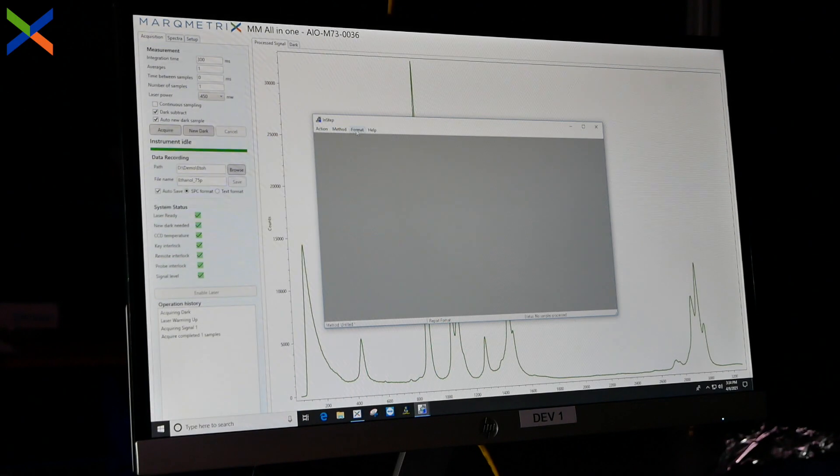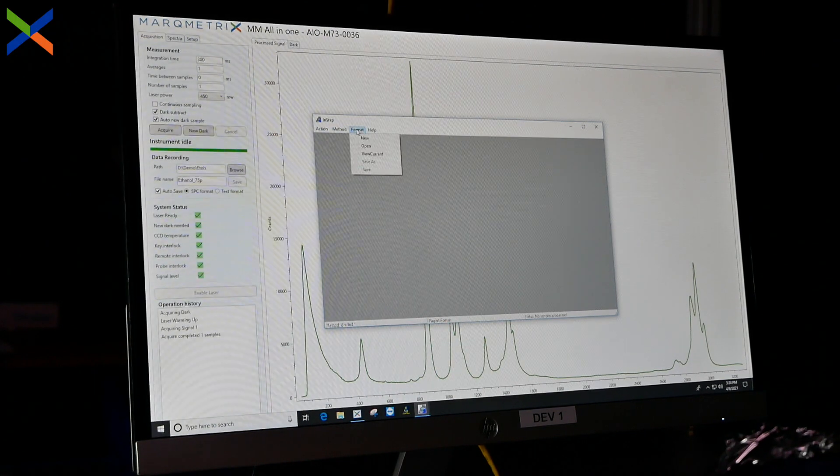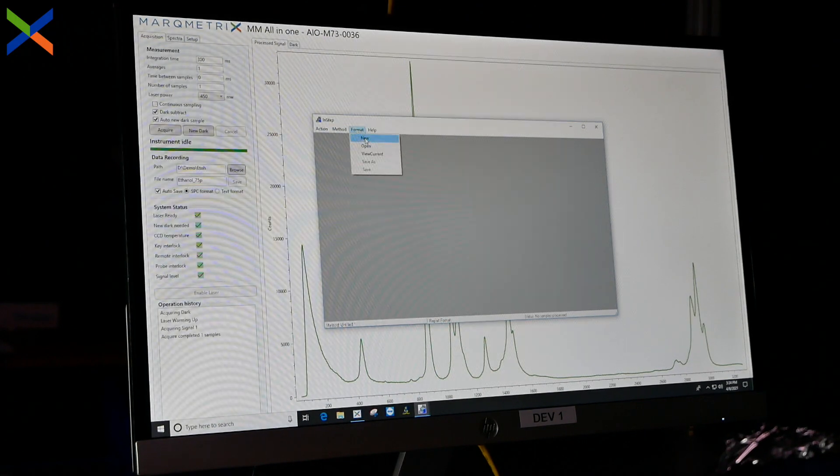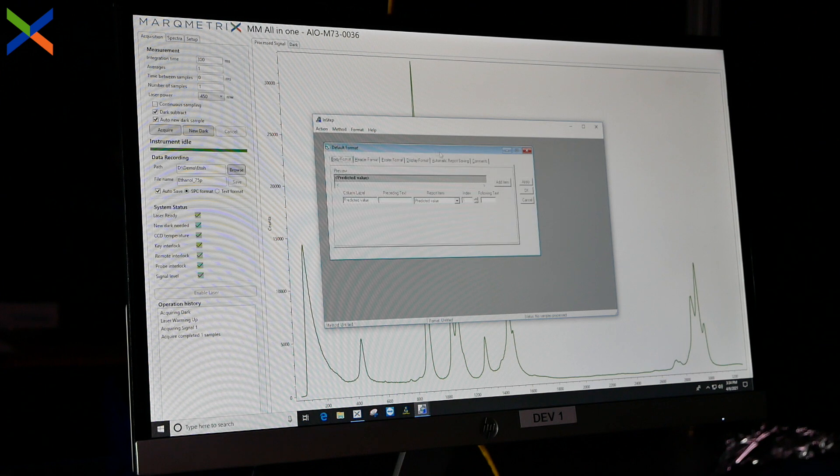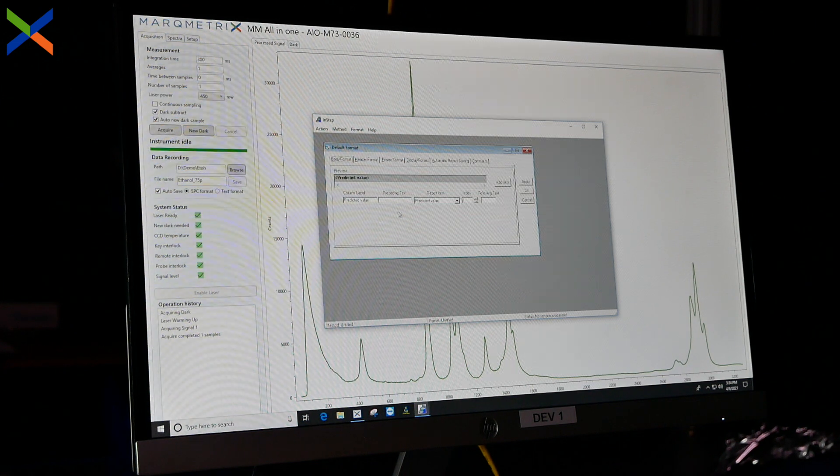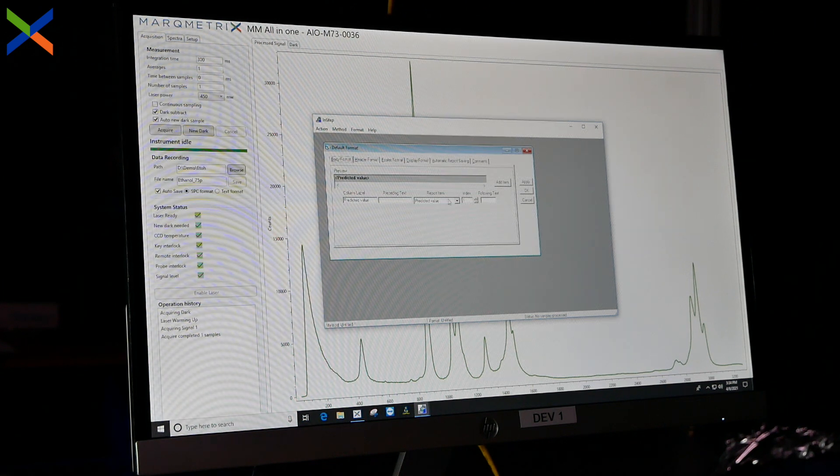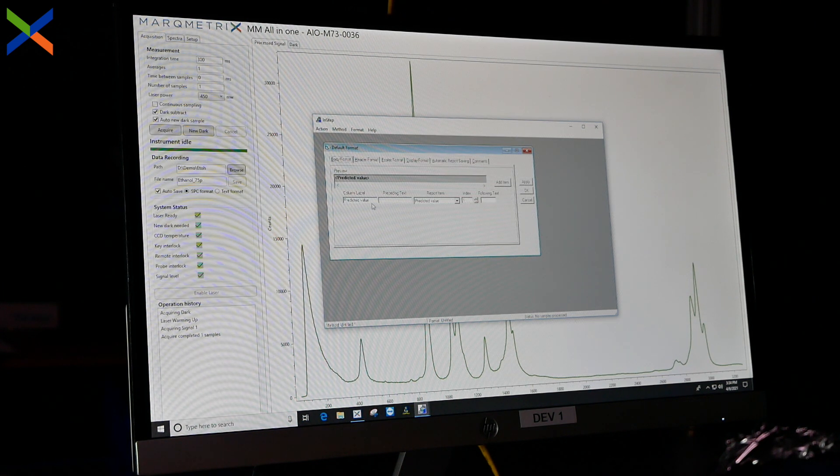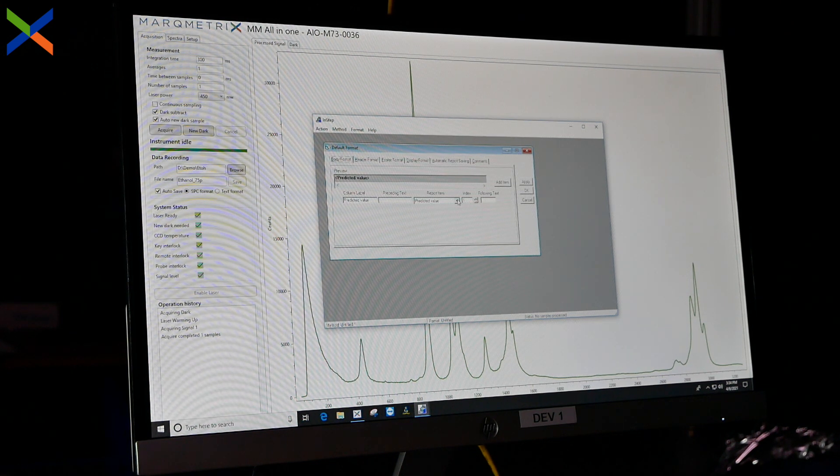For this video, we used the Infometrics prediction software, Instep, to predict the volume percent of ethanol in test and unknown samples.